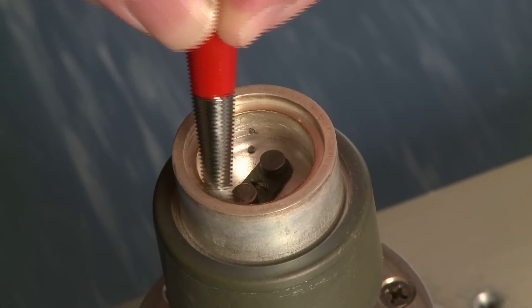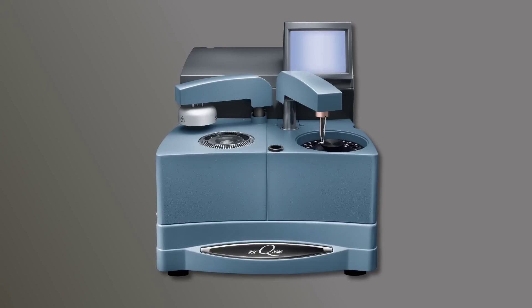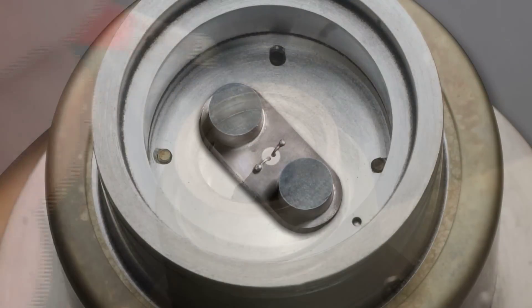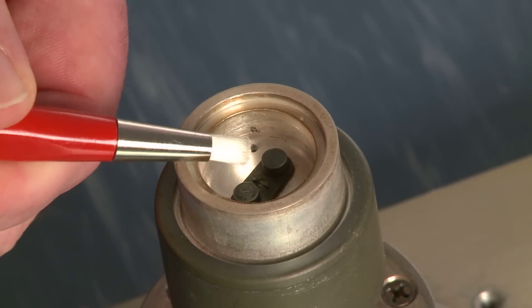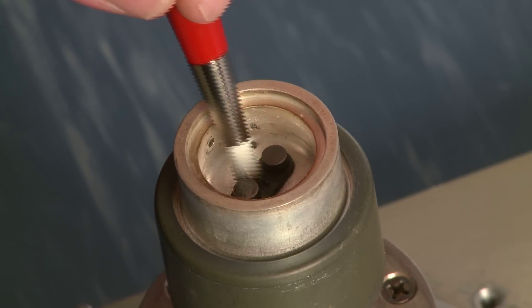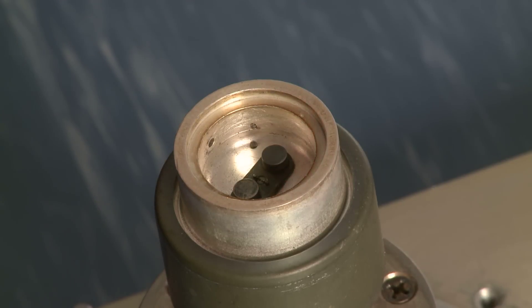You can polish the interior of the cell. For the Q-Series instruments, you want to be very careful when cleaning the T0 thermocouple. Let the brush go out a little bit and brush in one direction across it very gently. You do not want to break the T0 thermocouple.